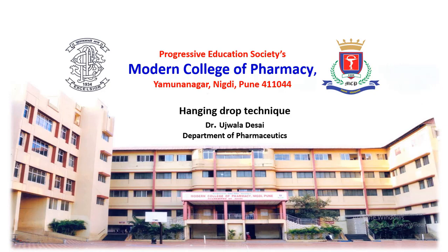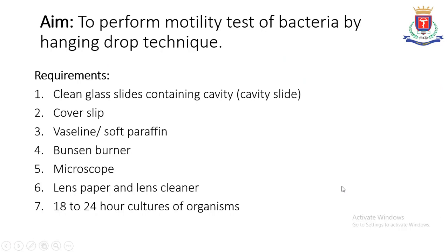So today we will see the technique called the hanging drop technique, which is usually used to study the motility of bacteria. Now following are the requirements for hanging drop technique.